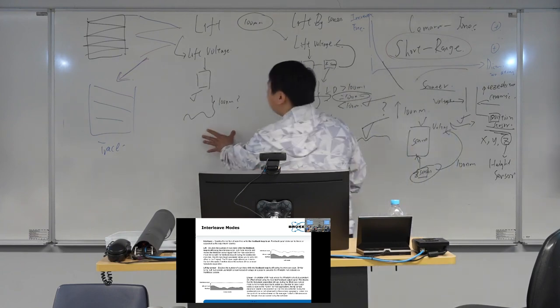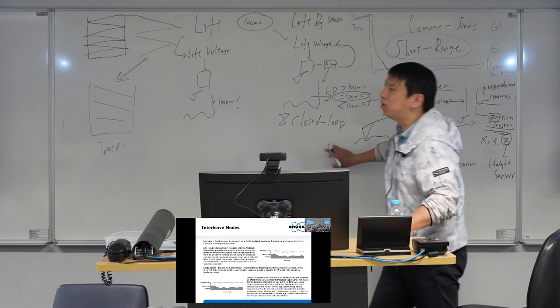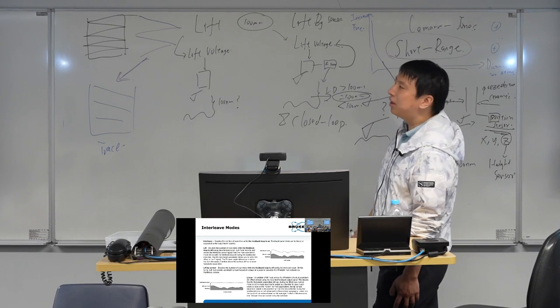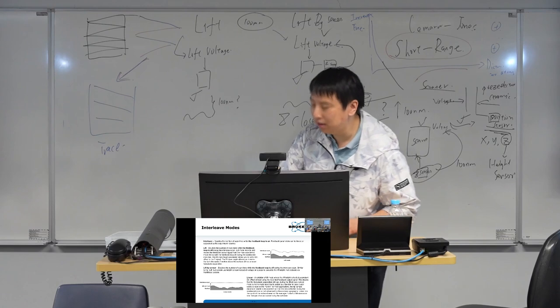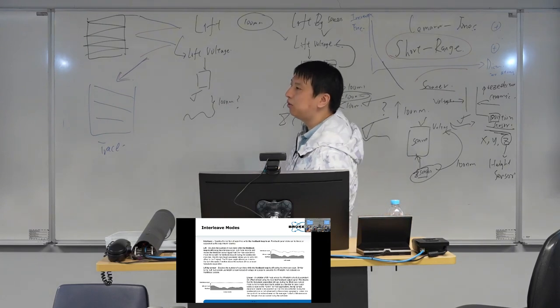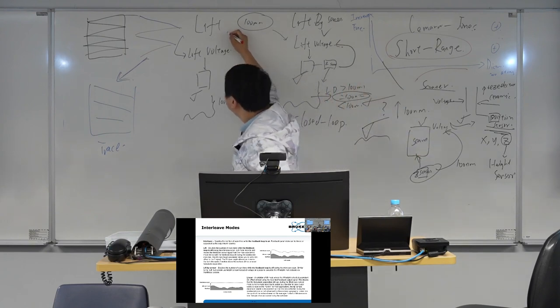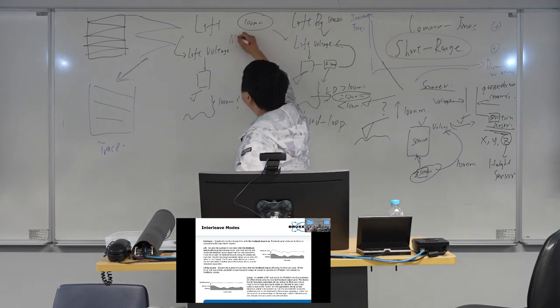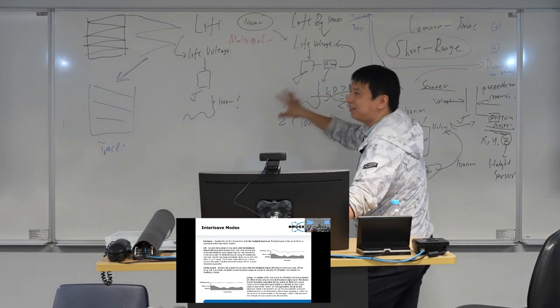Okay, that's the difference between the lift and the lift by sensor. Lift by sensor will guarantee your lift distance. So we recommend you use the lift by sensor. But we have some users of the multi-mode. The multi-mode does not have this sensor setup. So the multi-mode, just use the lift. That's enough. Okay. Hope I explained it.